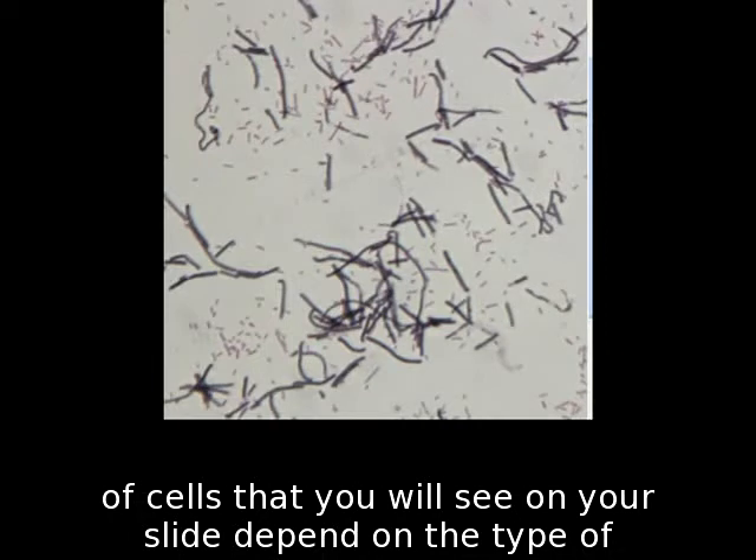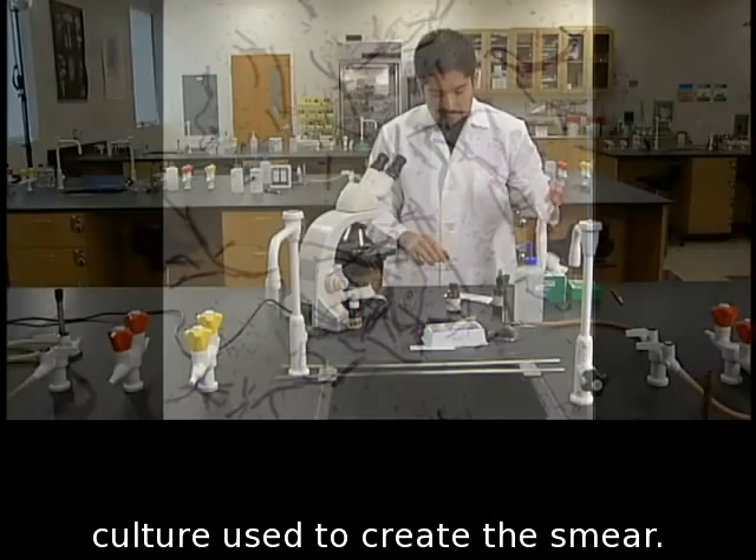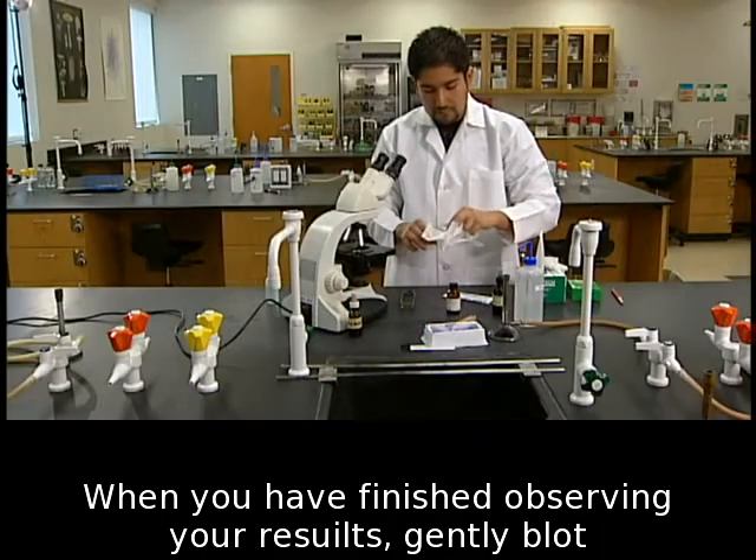The type of cells that you will see on your slide depend on the type of culture used to create the smear. When you have finished observing your results, gently blot the oil from the slide and store it in a slide box.